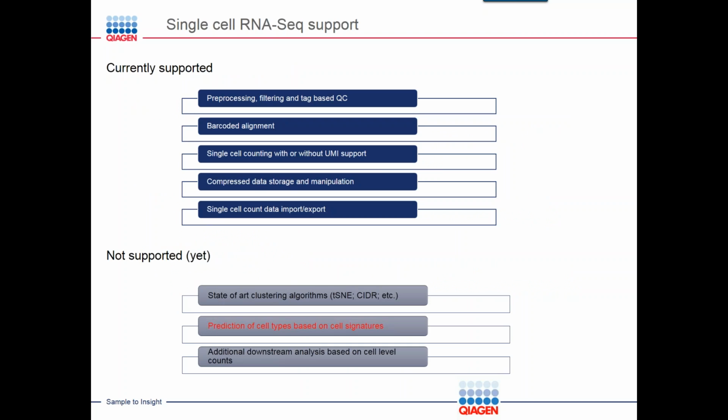So the next one I want to talk about is single-cell RNA-Seq support. We have been working on this for over a year now, and pretty much every company has already started this new technology or is about to start it. So there are lots of things going on with single-cell RNA-Seq. I think we have achieved a lot, but I also want you to be clear on what has been available and what has not been available.